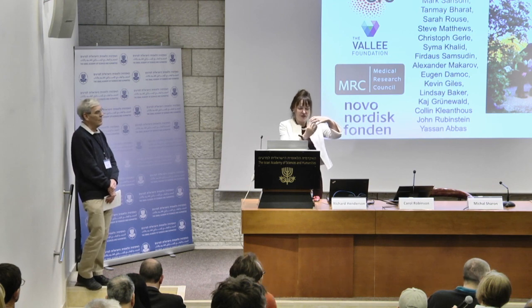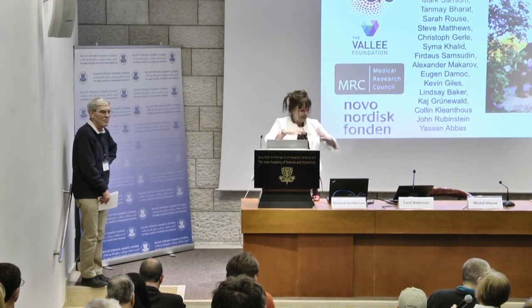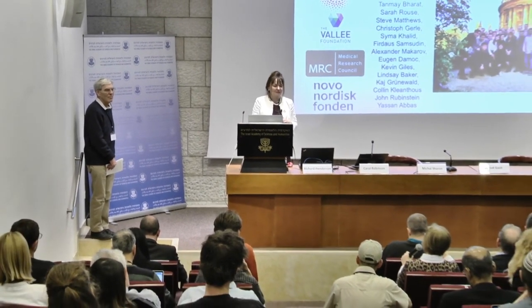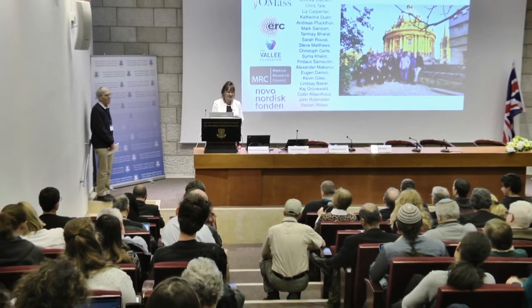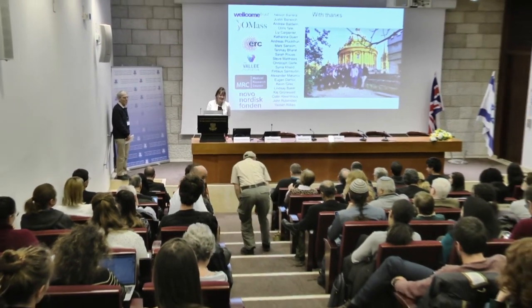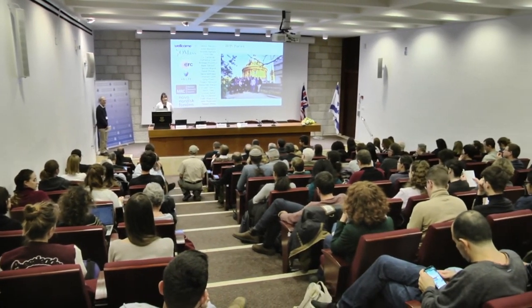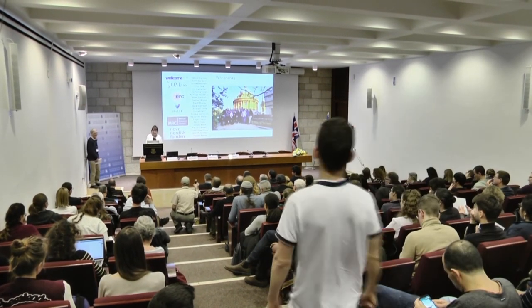So it's not the outer and the inner membrane intact, because we sonicate them and we expose things on either side of the membrane. Okay, so you've got inside out and also membrane fragments as well? Yes. Okay, thank you. So that gives you access to both sides. That gives you something else to worry about. Yes, if you want to. You're very good at worrying, so I'm trying not to worry. I just think it's exciting, but of course other people worry about it a lot.